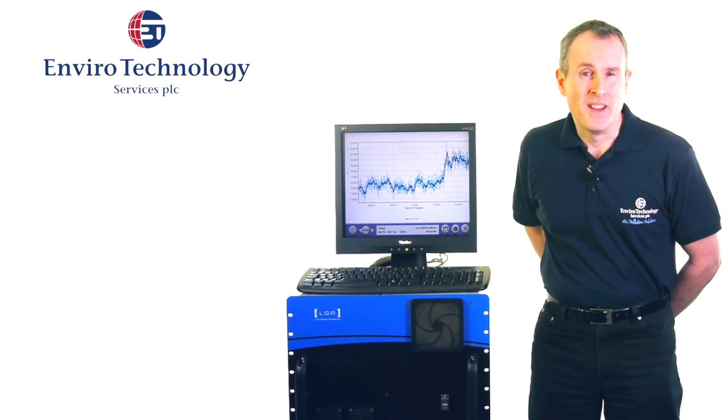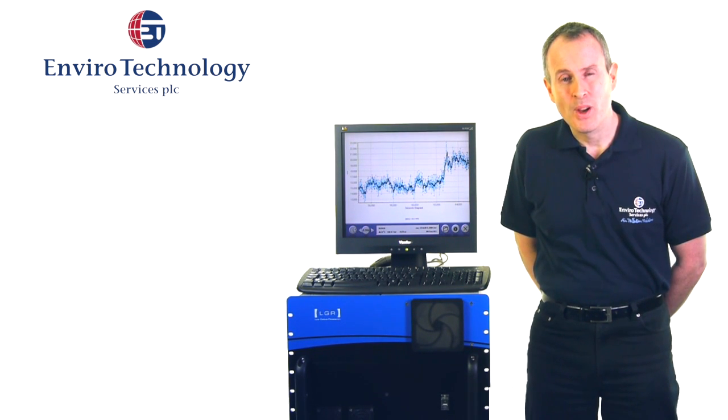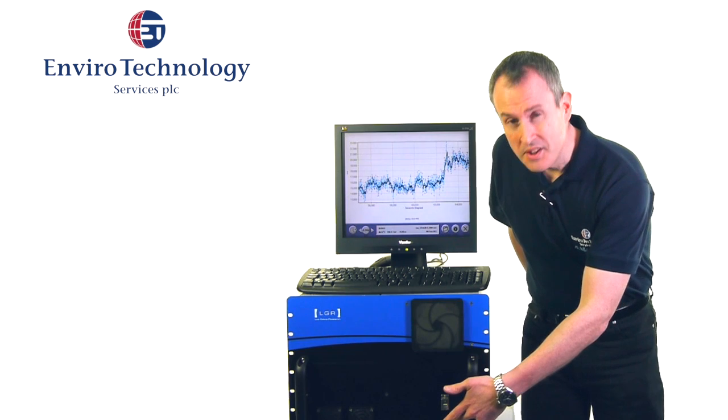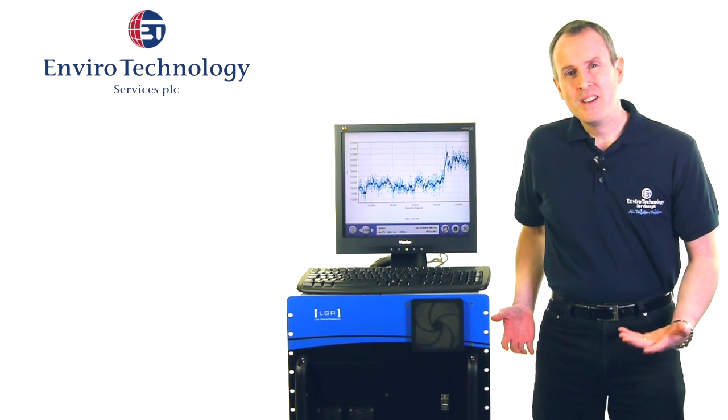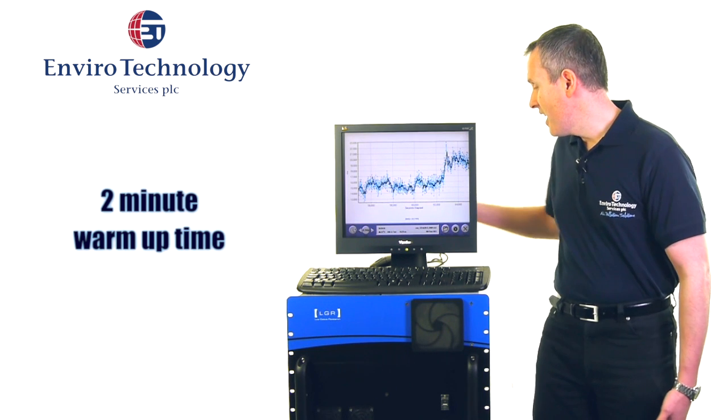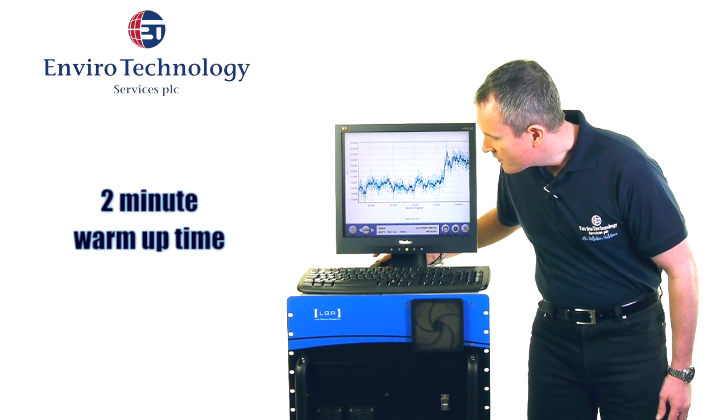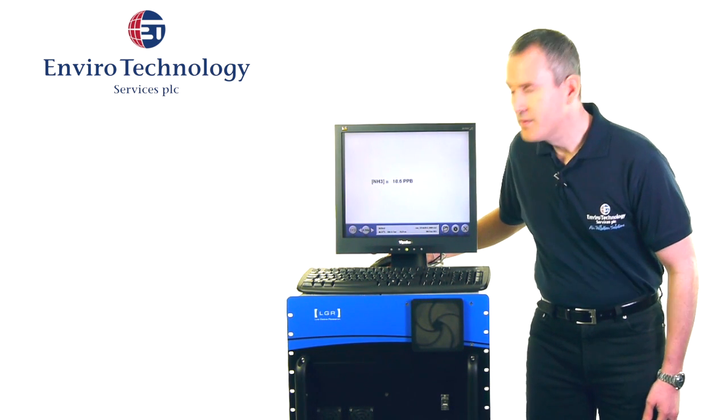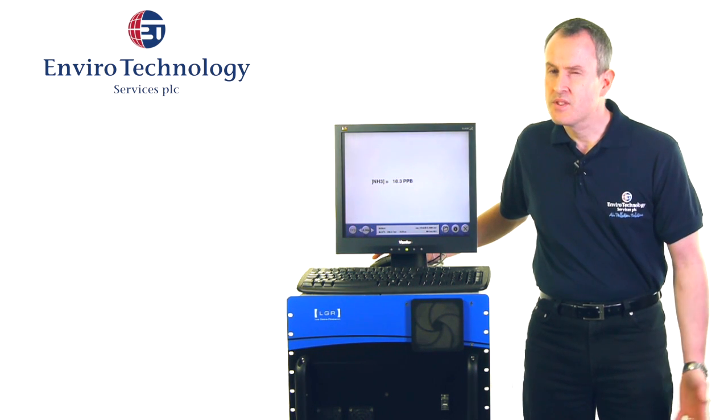We quickly make the connections for our sample line, switch the instrument on. It takes around two minutes to warm up and essentially once it's warmed up we start taking measurements. It's as simple as that.